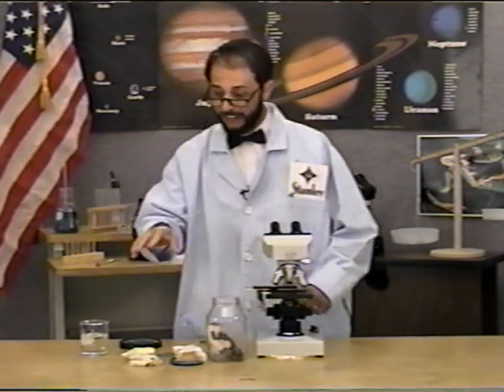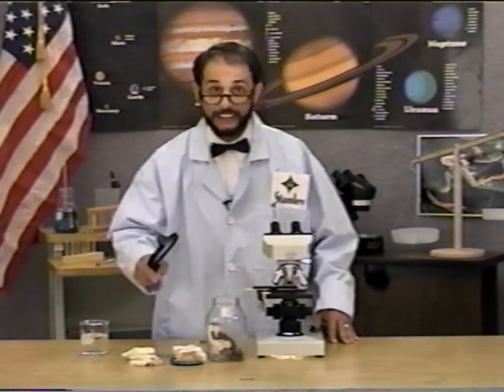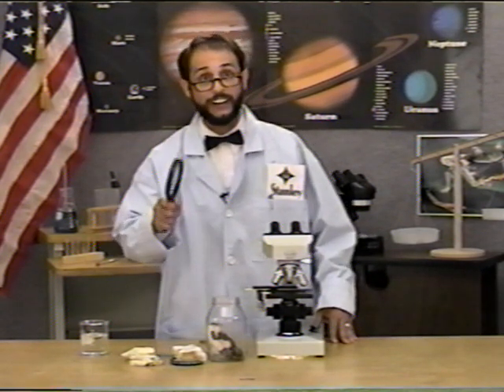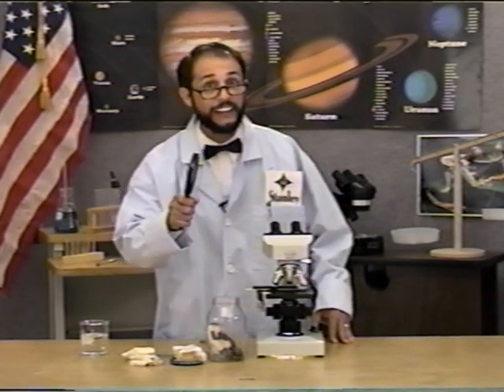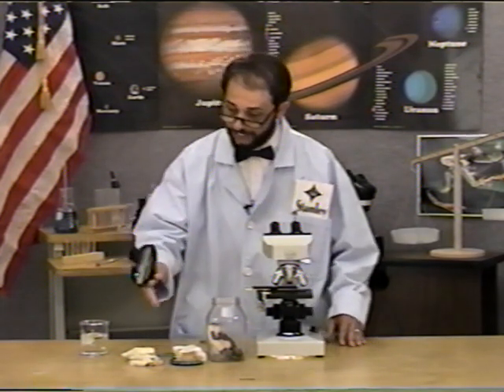In an attempt to see the growth of mold, I have put water on several pieces of bread here and put them into jars. I've taken some of them out so you can see them. You can do this experiment at home and check it every day. Here's some mold that's about 11 days old.